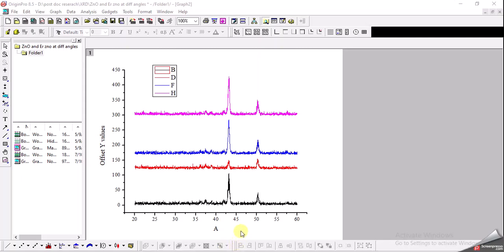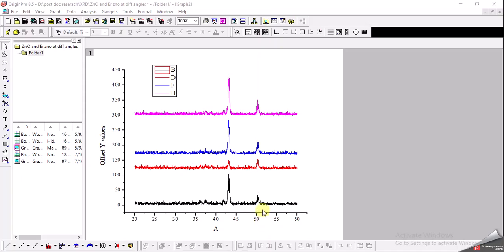Hello friends, today we are going to try to plot a 3D graph of the XRD data. Here you can see a 2D graph of XRD data of four samples. We have intensities on the y-axis and angles on the x-axis. I wanted to see why not draw a 3D plot for the XRD and compare it to this 2D graph and see how it looks.